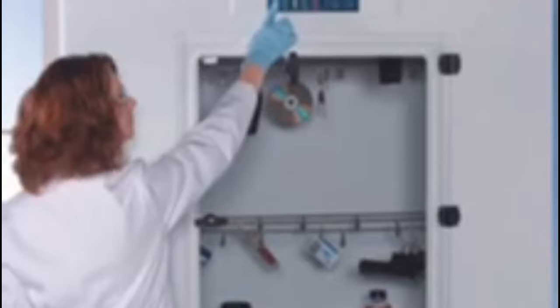Superglue fuming can be more useful in certain cases than dusting. This is because dusting can actually damage the prints, and some investigators may want to keep the original print there for longer. This allows you to make multiple lifts off the same print.